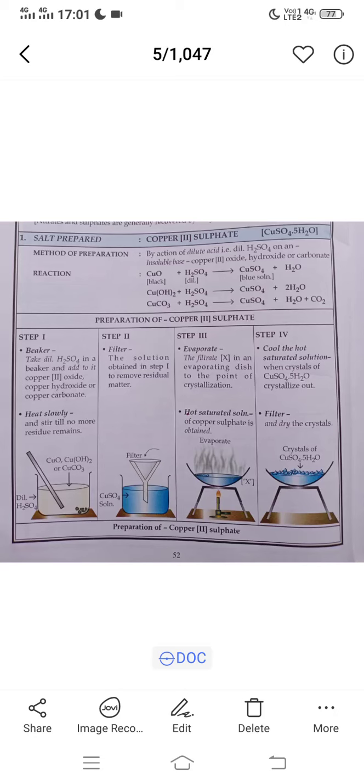Hello dear students, today we are going to see the preparation of some different types of salts. The first salt you can see here is copper sulfate.